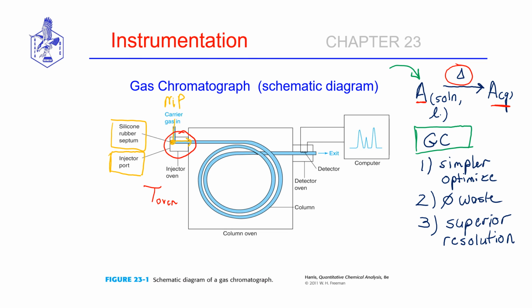These are typically capillary columns that are very long, can be as long as 30 meters, and so they are wound up into little circular components, and then the end of the column is here. So just like the injector port needs to have controlled temperature, so must the oven. The temperature of your oven has to be under computer control, and you have to tell the instrument what temperature you want, if you want to change that temperature at any point, etc.